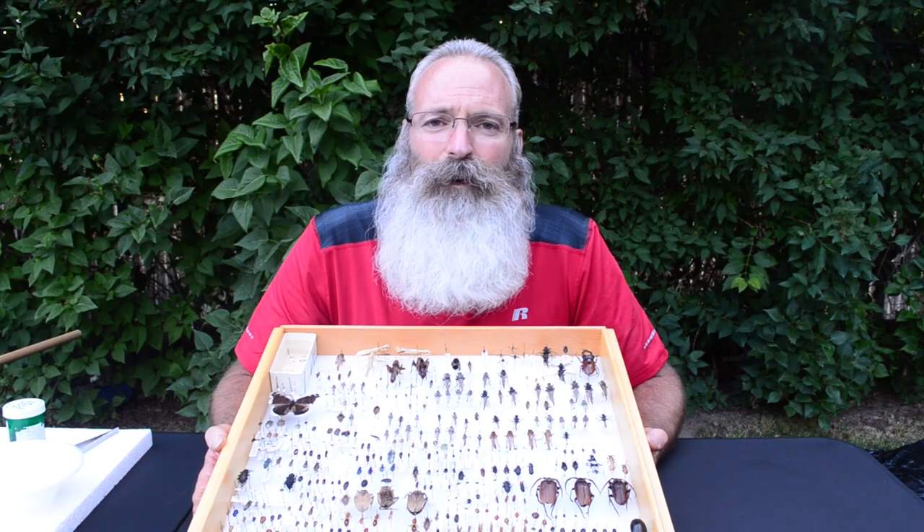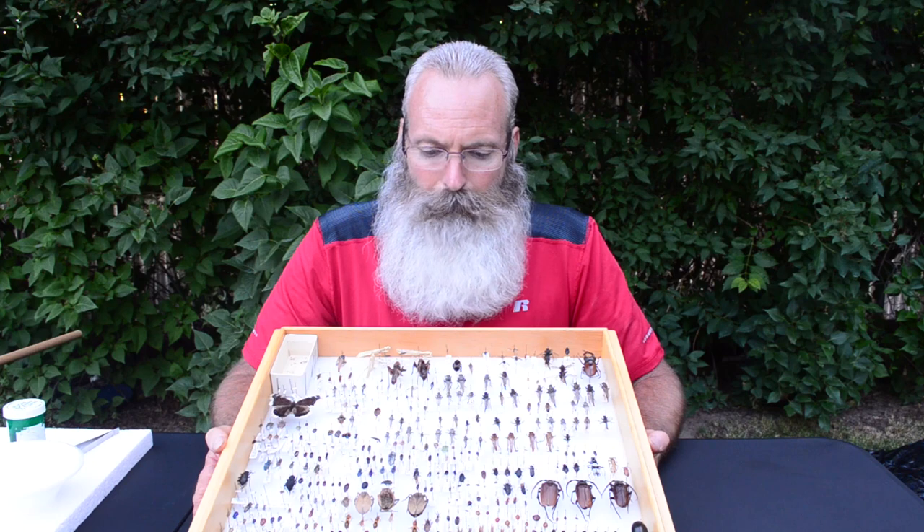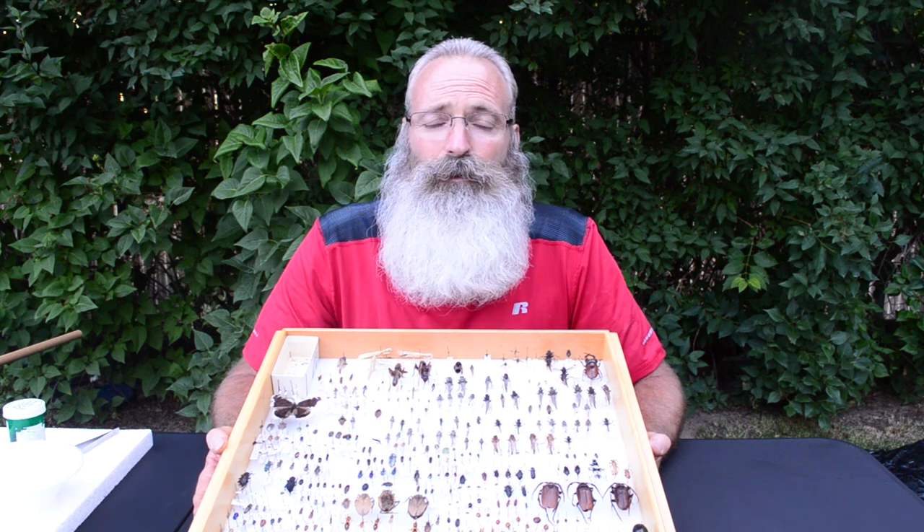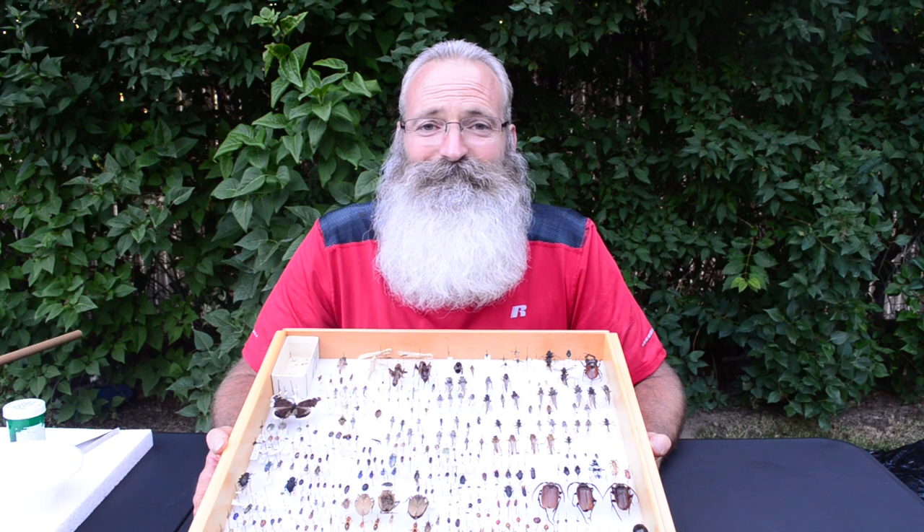In this segment of our video, we're going to learn how to pin insects, how we're going to place them on the pin, and then get them ready to display for your class. I've been out collecting in the yard and got a whole bunch of insects the last couple of weeks.